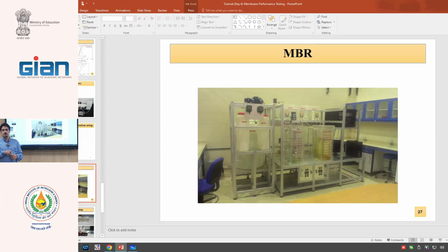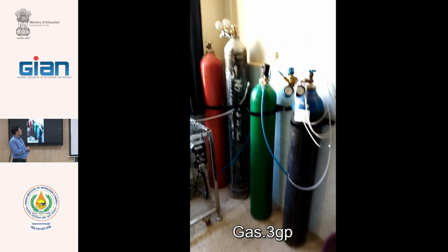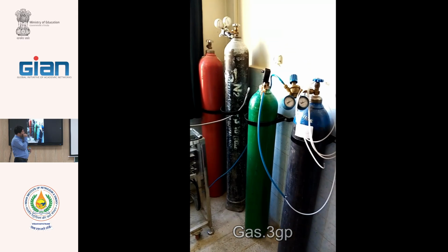Any question about the setup? We have a pervaporation setup, a membrane distillation setup, and a dialysis setup, a bigger one, but no time to show. We have a minute. A video, please. It shows the entrance of the gas setup. Yes, the gas video.